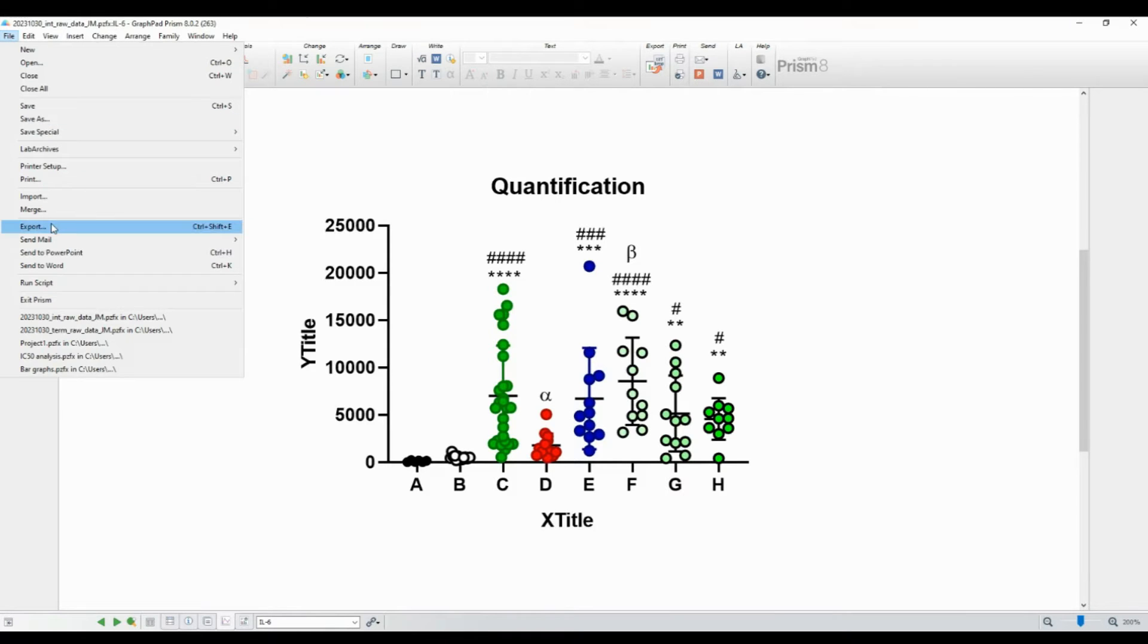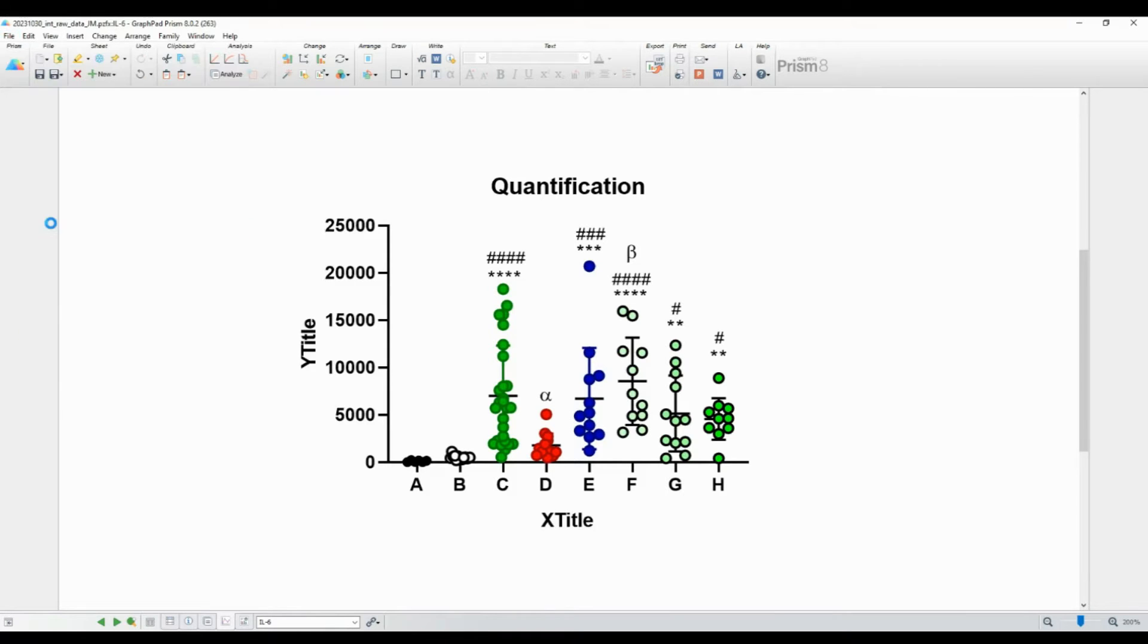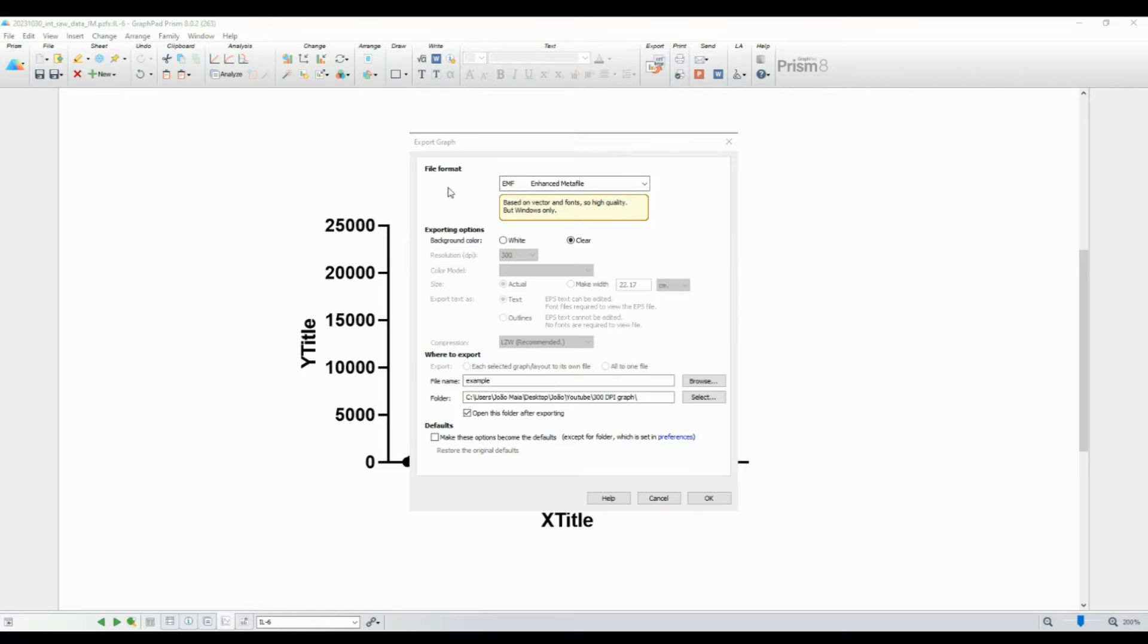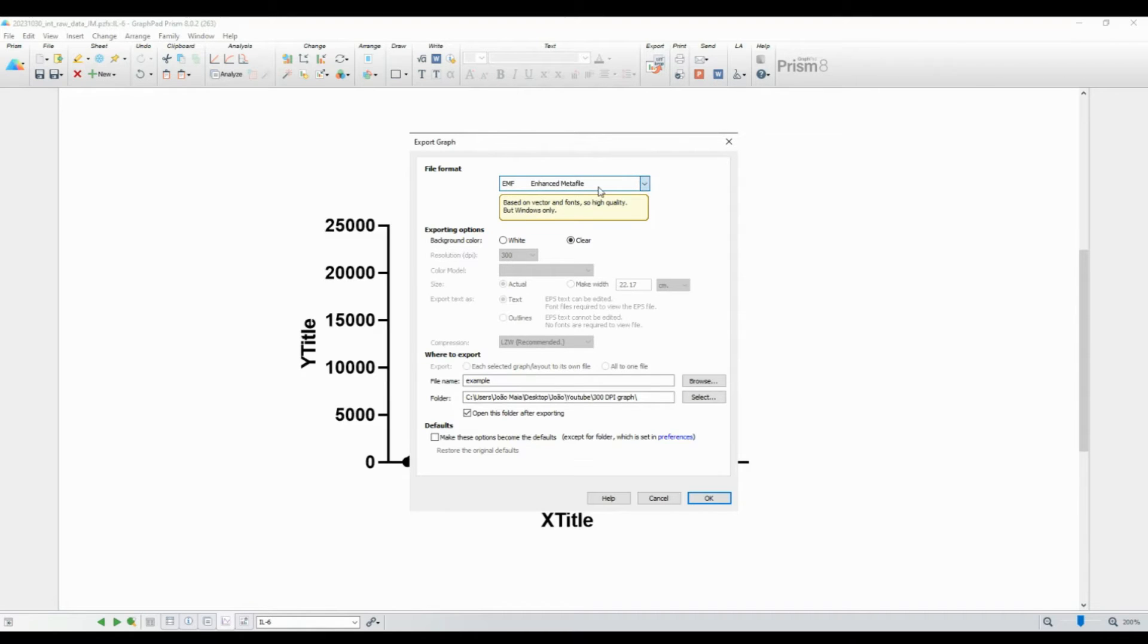A window will appear with various export options. Select Export as image. In the next window, you can choose the file format. To export as TIF, select TIF from the list.